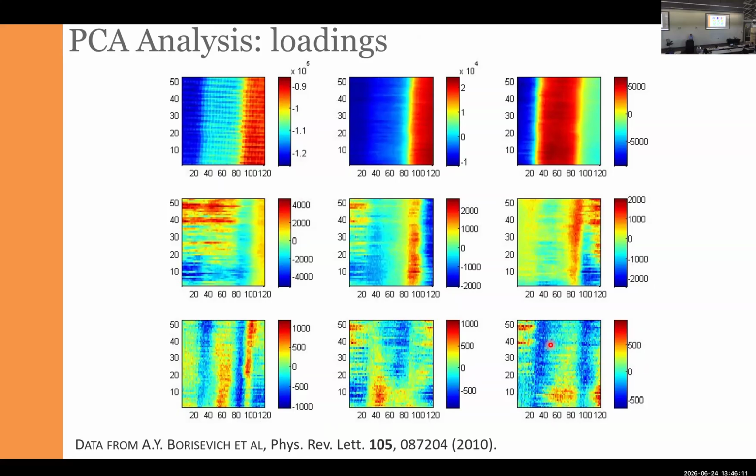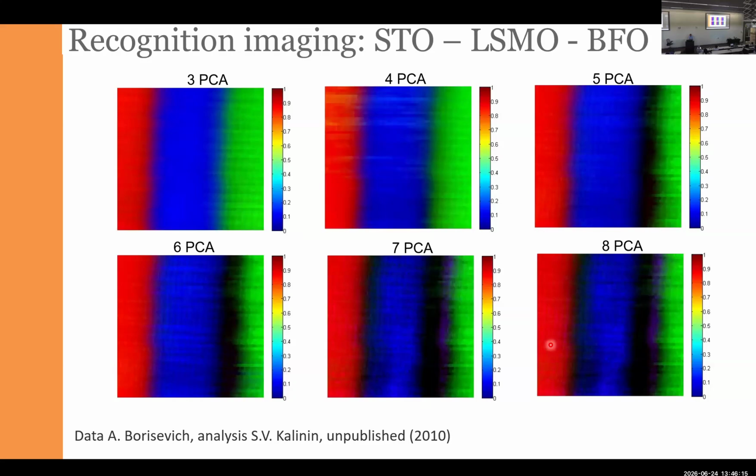So it becomes a case where you have so much data that you get lost in it. At the same time, if you build the classifier, then it becomes questionable. Depending on how you configure it, you can get the situation when all the components are interpreted, you can get a situation when there is some anomaly, and then there is a situation when anomalies are everywhere.